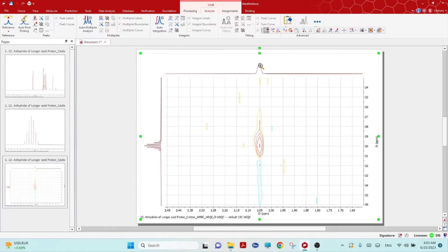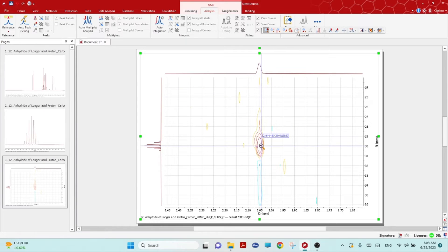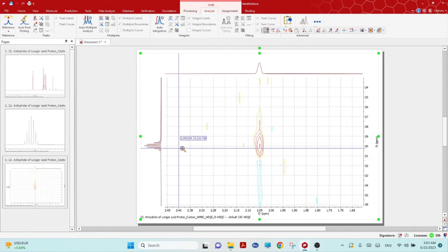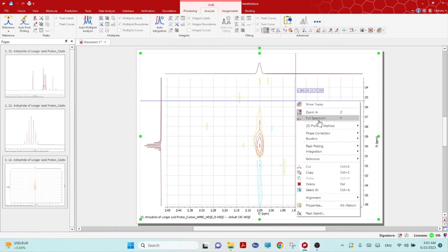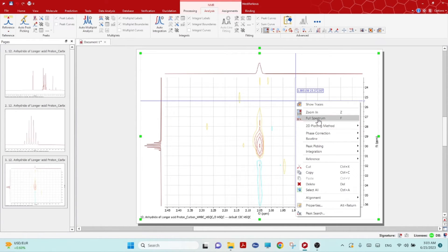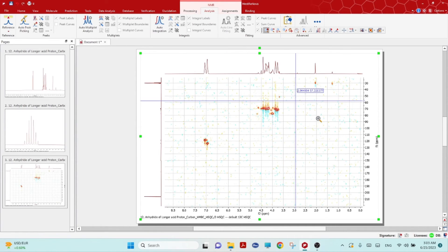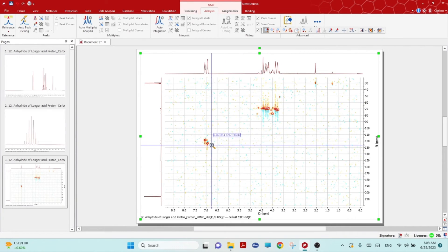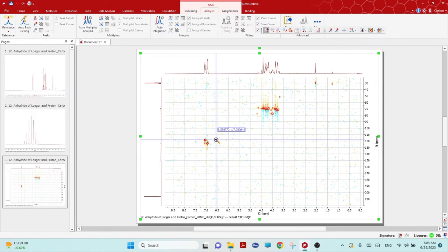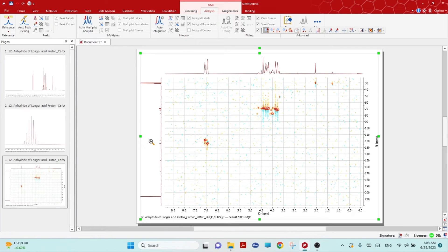You must have known that the HSQC is actually used to determine which proton is attached with which carbon.